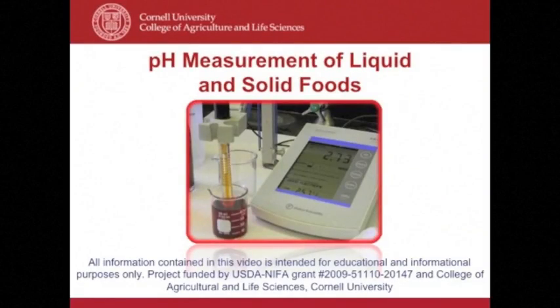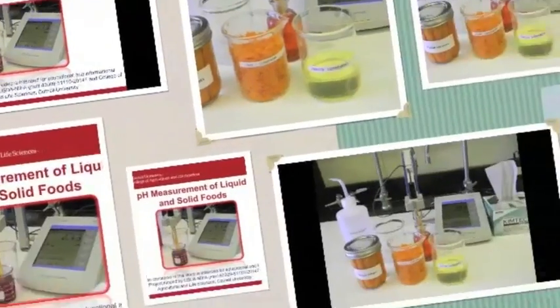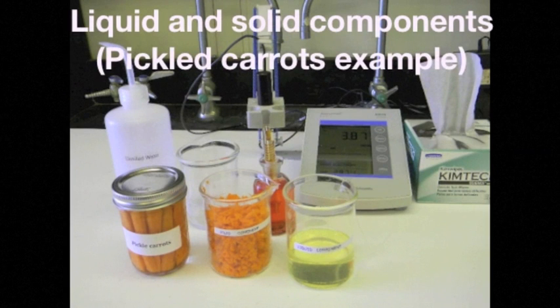This educational video demonstrates how to measure the pH of a food sample made of liquids and solids to comply with FDA acidified foods regulation. We will use a pickled carrots example.